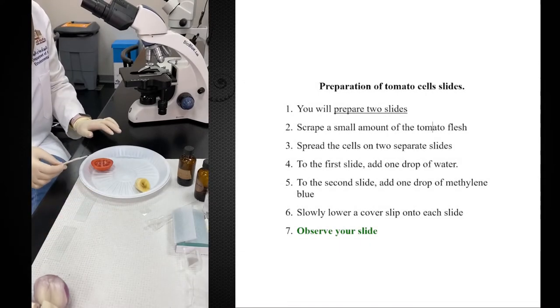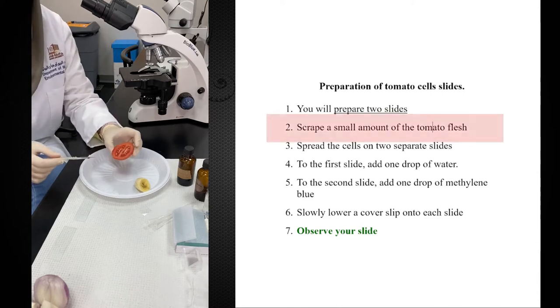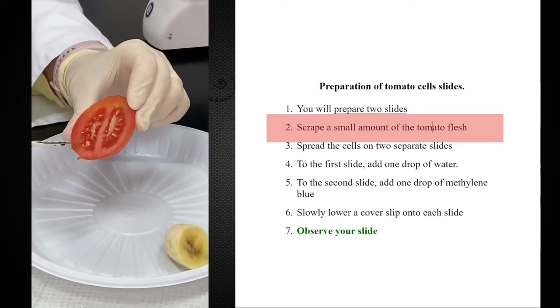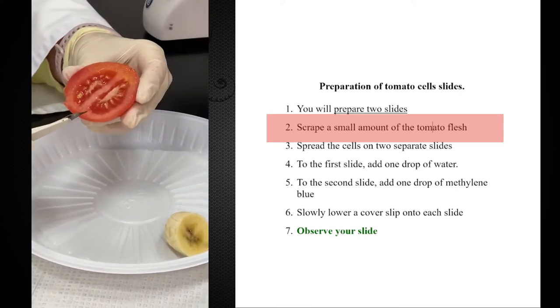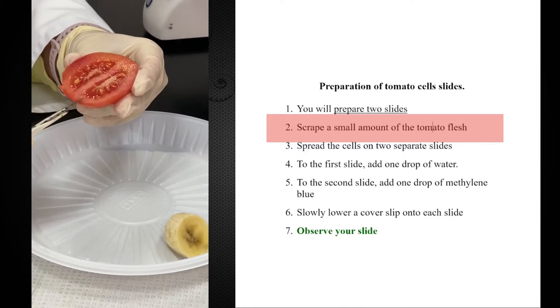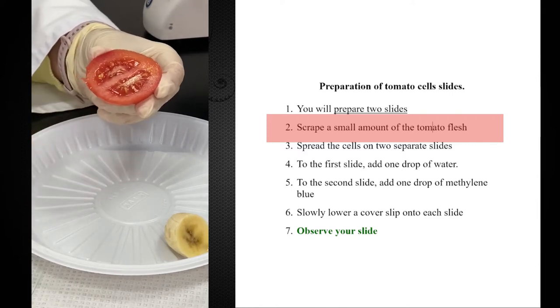Okay, I will start by the preparation of slides of tomato. To prepare a slide of tomato, you need to take a few cells not from the skin, not from the pulp, from the actual flesh of the tomato. You do this with a blade or with a knife. You just take a little bit, scratch it like this, and put it on your slide.